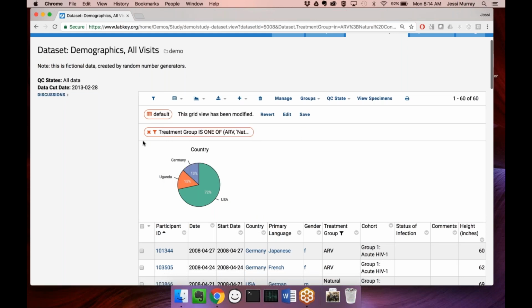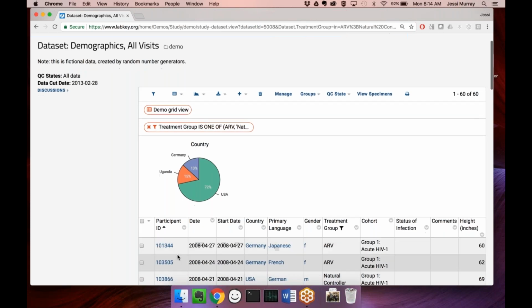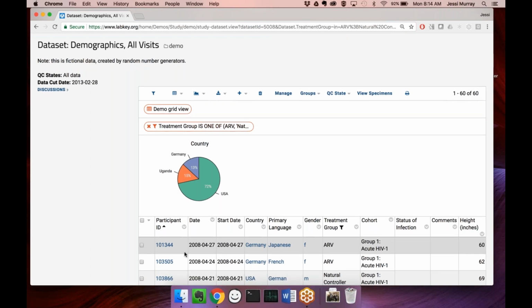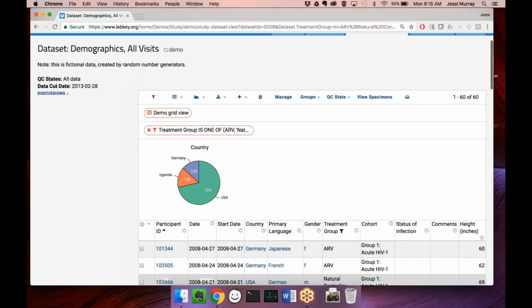not quite sure why that laid out, sorry. But your updated view info will be up here. And if I save that, saved. Then whenever someone, either I or if this is a public view, loads this view, will also have the participant ID sorted as expected.